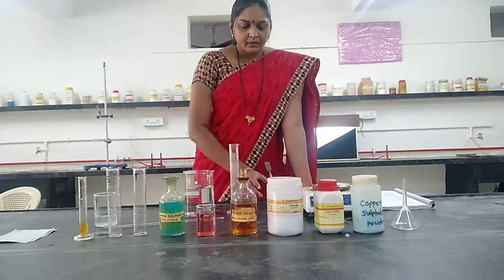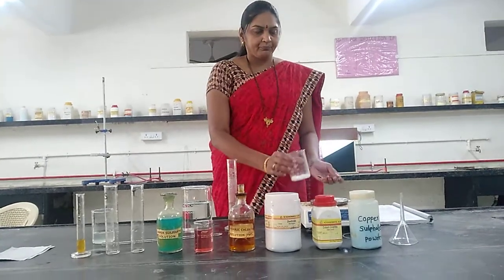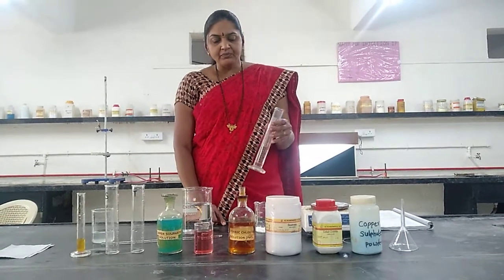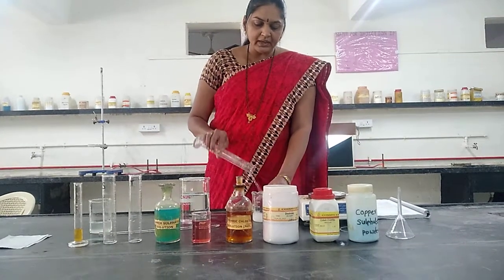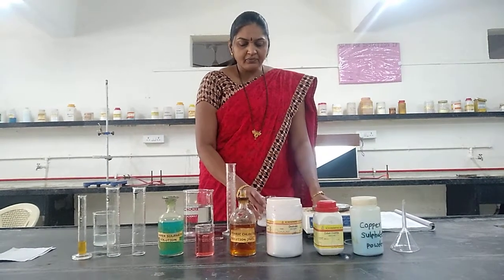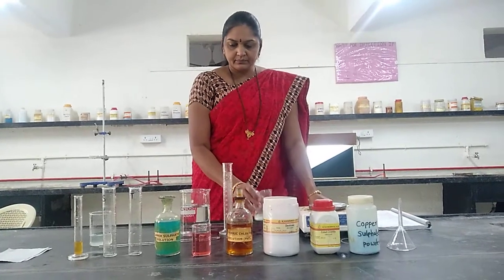First, dextrose has to be weighed, 25 gram. The 25 gram of dextrose that has been weighed is dissolved in 50 ml of distilled water. 50 ml of distilled water is added. It gets dissolved. After dissolving it, this is the sample solution.